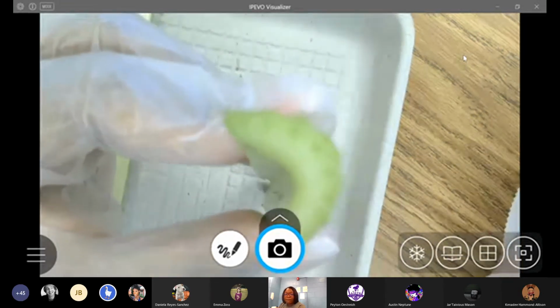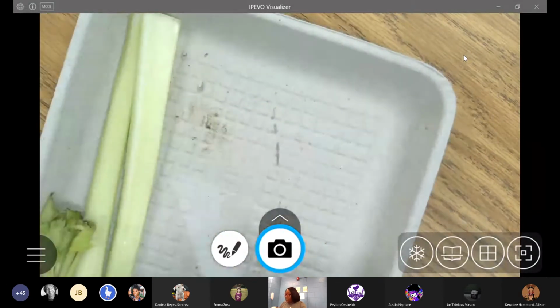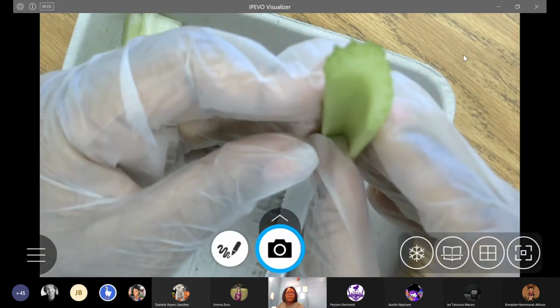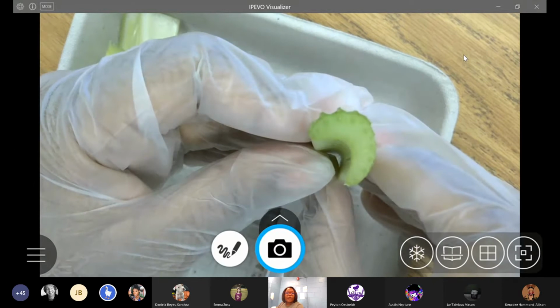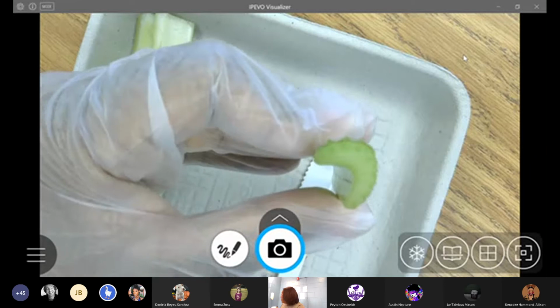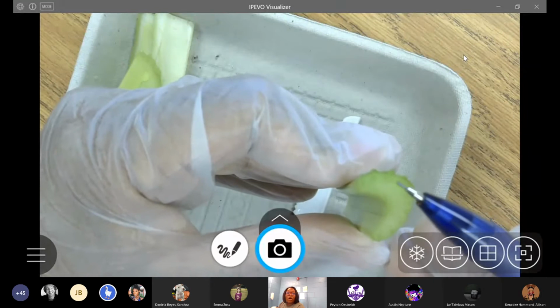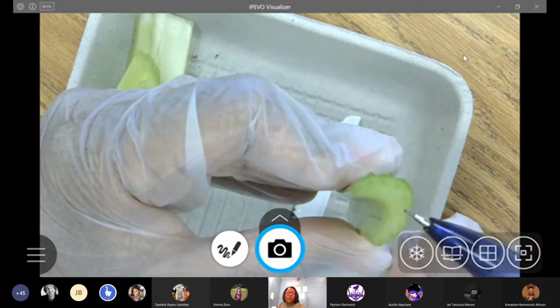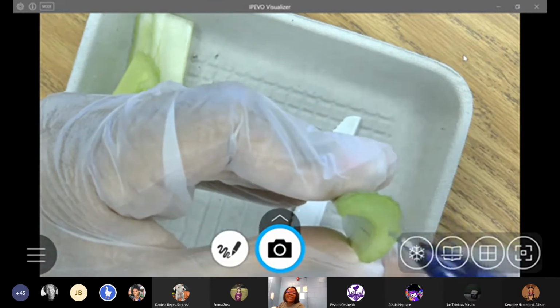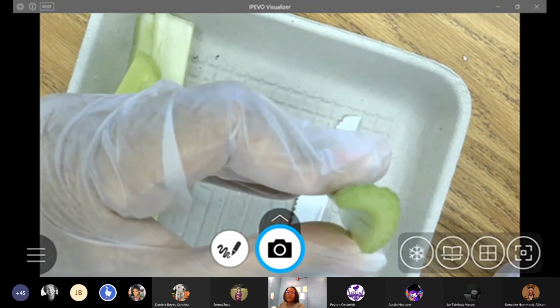Go ahead and draw those dots. I'm going to cut this in half so maybe you can see a little clearer. Focus, focus. There we go. So you should see those little dots there. And those little dots show you, each of those green dots is the xylem. Those are the highways that carry water throughout the plant. Okay, notice how organized they are. They're in a nice little pattern there. That's super important to look at and remember.